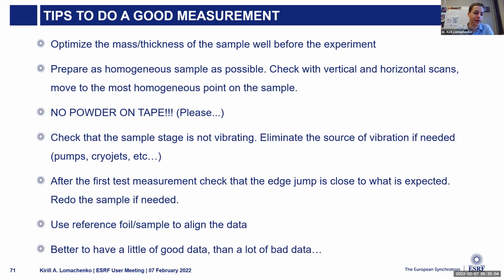And also a rule of thumb, it's better to have a little data than a lot of bad data. If you think something is fishy about your experiment, sometimes this little detail ruins the data, or at least makes the data analysis very difficult. So if something seems fishy, it's better to investigate and spend some time on it.